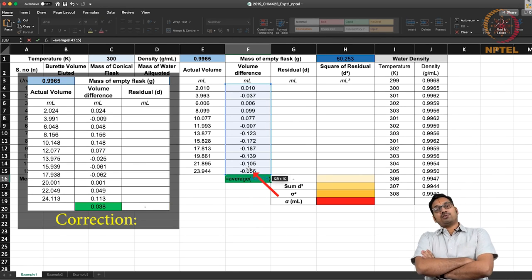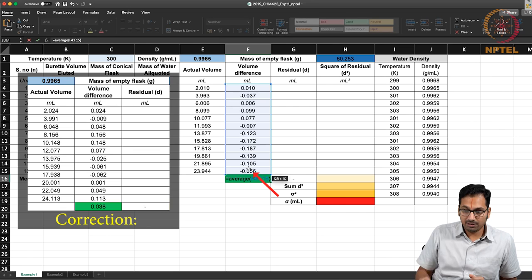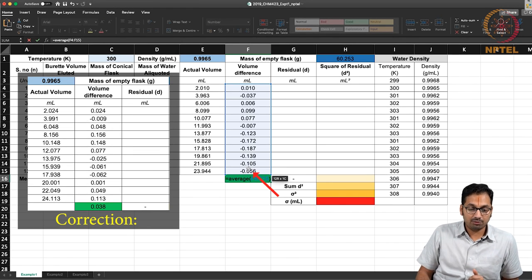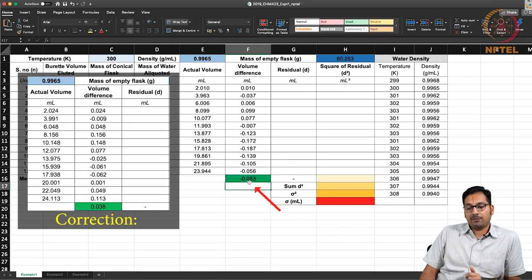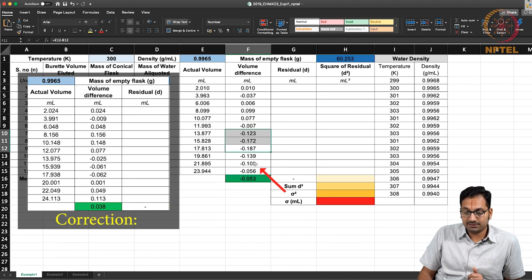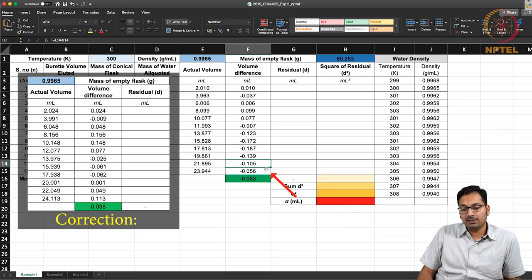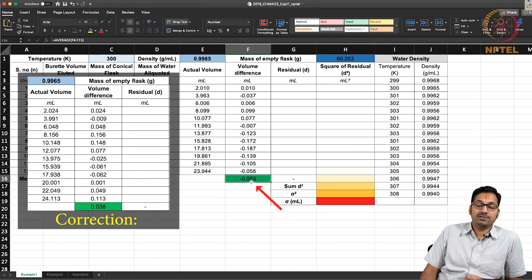One way of determining where you fall is to take the average of these differences using the average formula. The average is nothing but the ratio of the sum of each value to the total number of measurements. You are able to realize the average nicely represents values across — you have some values that deviate by minus 0.19 ml and others deviating by minus 0.10. The average of all of this, including positive deviations, finally comes up at an average of minus 0.05.